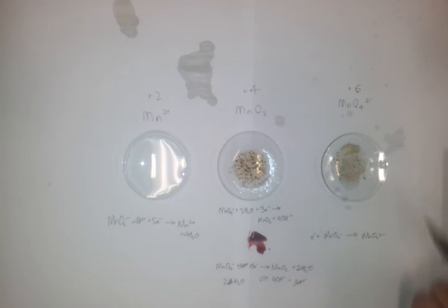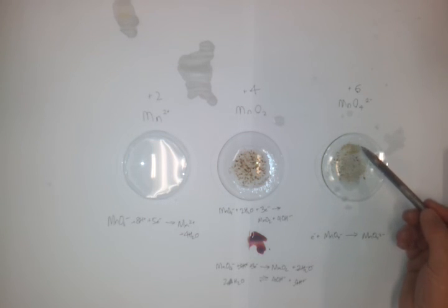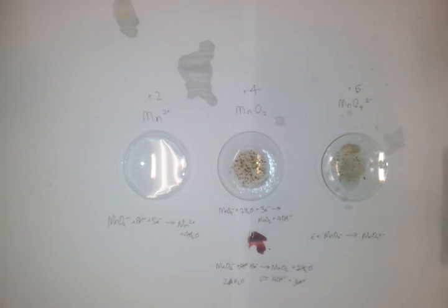And actually it's quite good. As I've left this sitting here, a little bit of green has actually formed just at the top here, which is the colour we would expect to see. But as I've said before, and the reason it took 3 times, this reaction is quite hard to get working well.